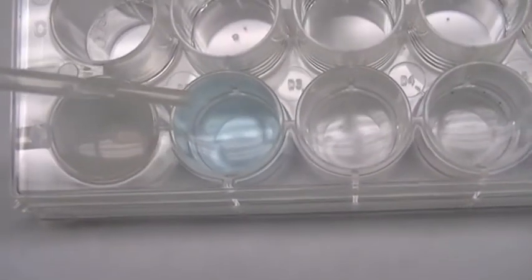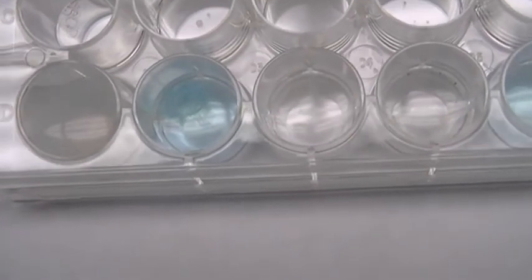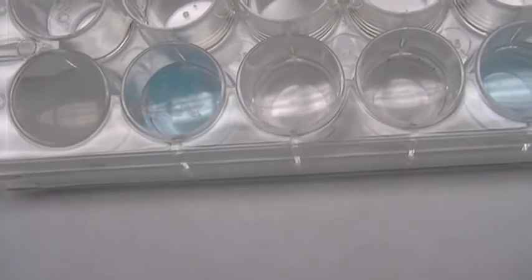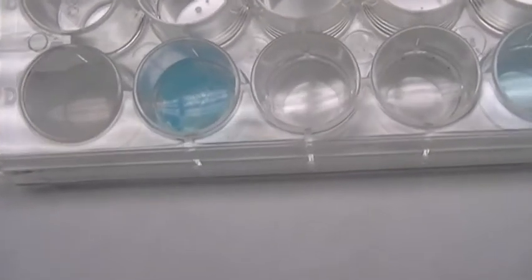All right, and then you stick it into the copper. And you get a precipitate in that one, a bluish precipitate. Add a little more. Full drop didn't come out. There we go. So you have a darker blue formation.